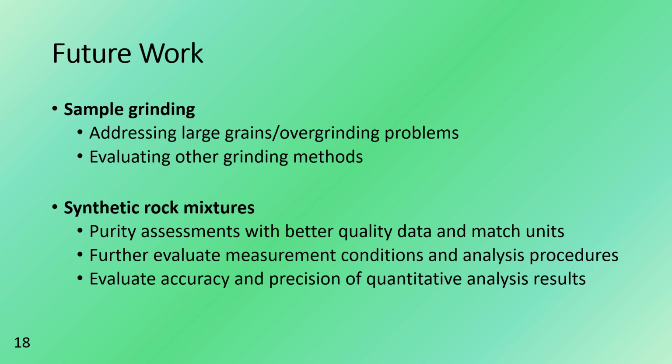But once we can do that, then we can use those rock mixtures to evaluate different measurement conditions and quantitative analysis procedures for multi-phase samples, like rocks. And those synthetic rock mixtures should also be used to evaluate the precision and accuracy of quantitative analysis results as well.